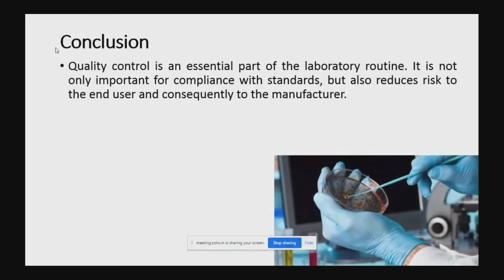So this is about the role and responsibility of the microbiology laboratory in the pharmaceutical industries. In brief, there are a few techniques available, and by using a few techniques, we are performing many tests. Techniques are common for all the tests, so we need to follow those techniques with precautions. Microbiological testing is a 100% manual analysis, so we need to follow many aseptic practices. We need to take care to avoid false results during analysis.